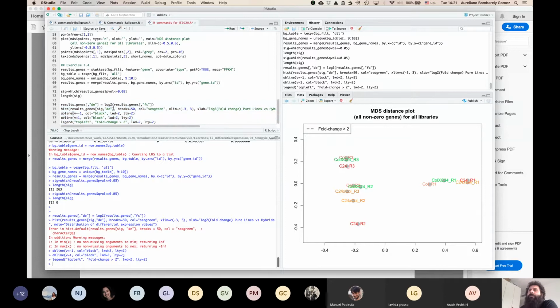Of course, I think that there is some error here. Breaks, sig. Let me see.